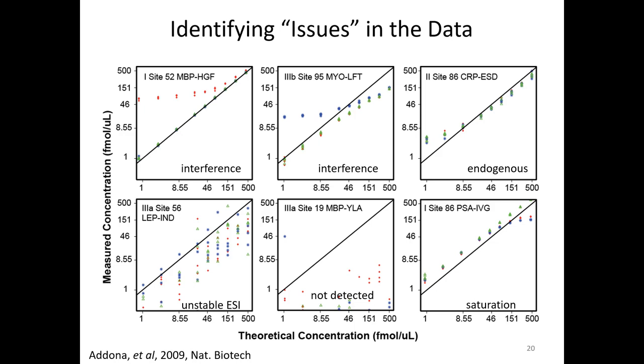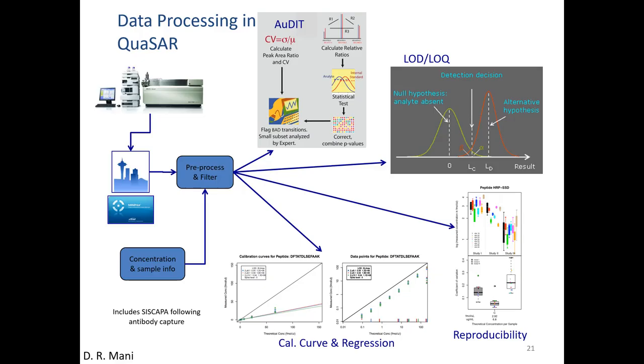You have a really large working range, and you have to get up to this kind of concentration so that it provides or informs your decision to select for that weaker transition monitoring. Yes. Yep, that would be something. So the question was, if you have to get up to ranges that high, would this kind of data influence choosing the most intense transitions or not? And of course, other ways around it are diluting the sample, so you can get to those higher amounts, and then you just have to do more math to factor in all the dilution steps you did. Yes, it just gets more complicated.